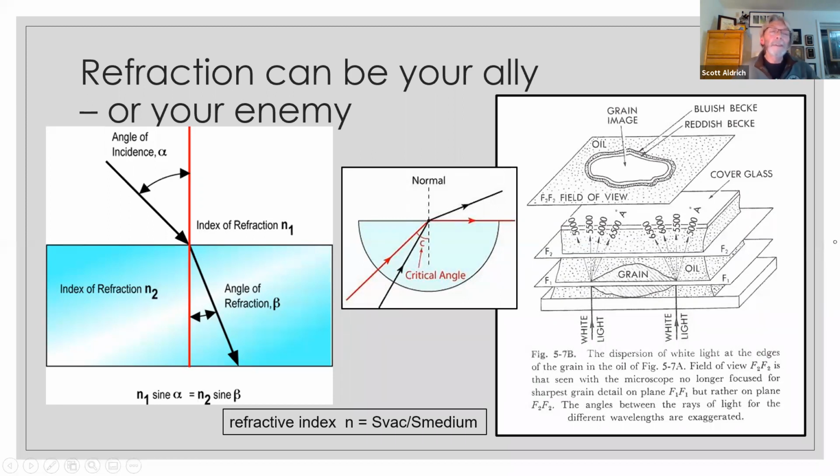So think, conceive of this cutaway looking at this grain trapped between a microscope slide and a cover slip. Let's say we have a grain of sand here and we have a liquid or refractive index immersion oil that's surrounding the grain.